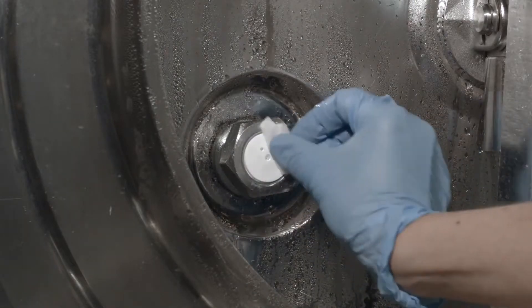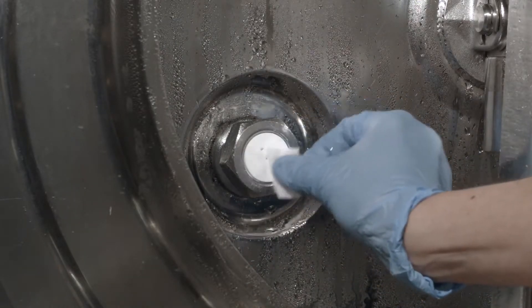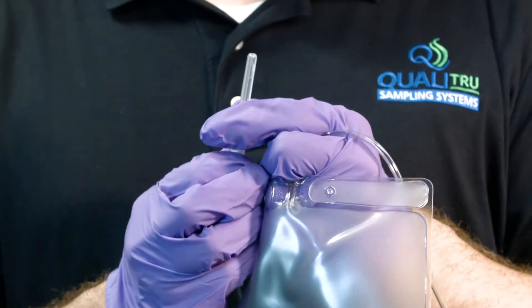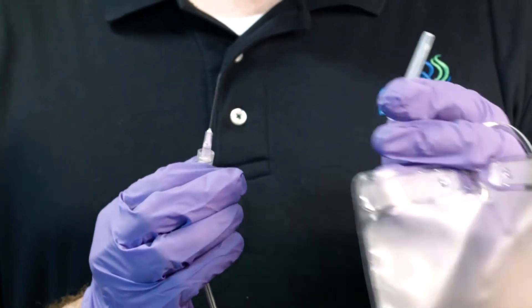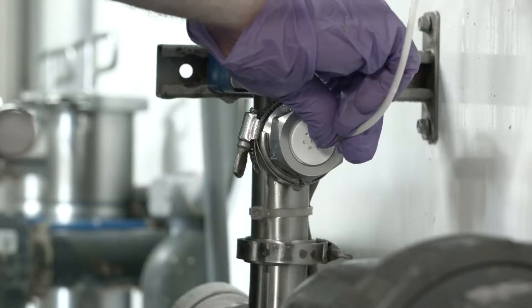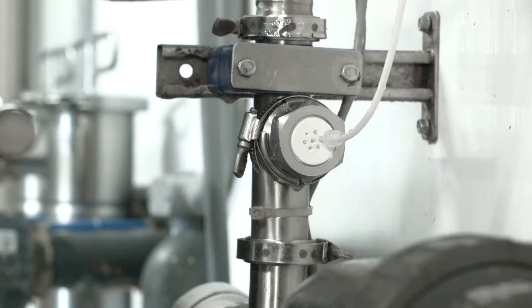With an alcohol swab, sanitize the surface of the septum for 15 to 20 seconds. Next, remove the safety cover from the needle attached to the collection bag and then insert the needle into the septum. Save the safety cover for needle disposal.